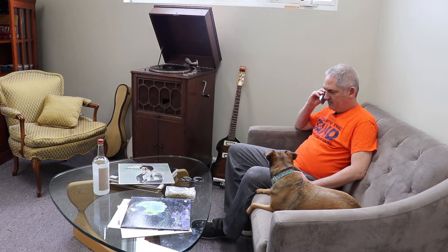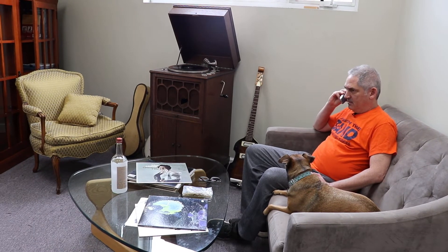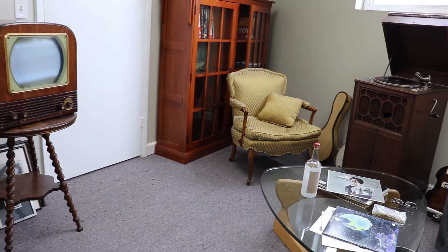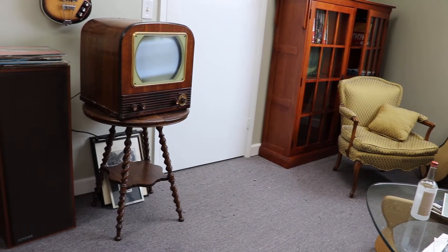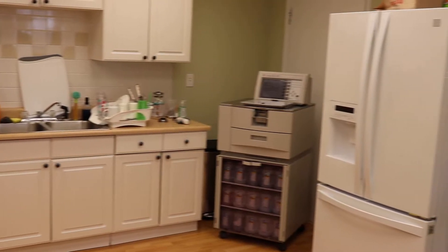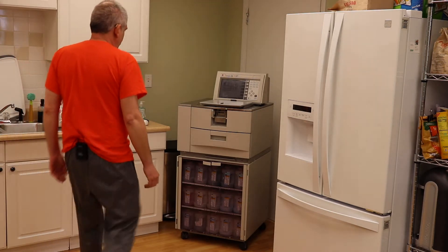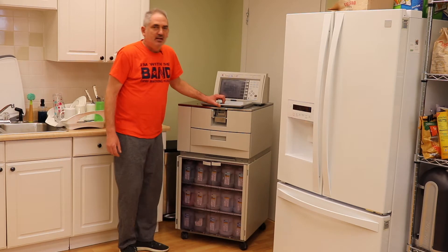Like most modern families, my wife and I have a VIP tissue processor in our kitchen. I just wanted to do a quick video about a simple piece of maintenance that a lot of people forget, and it can get out of hand rather quick.